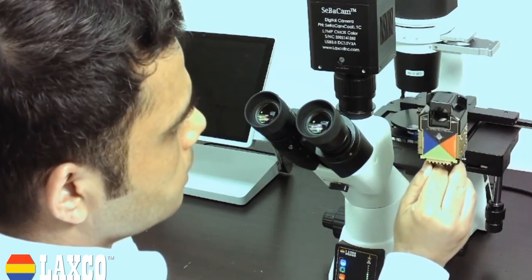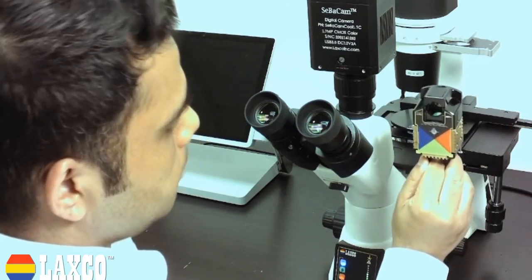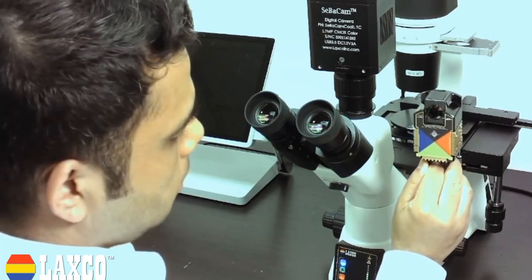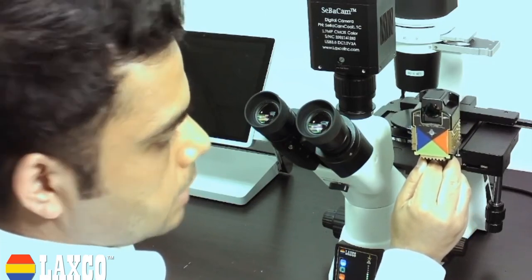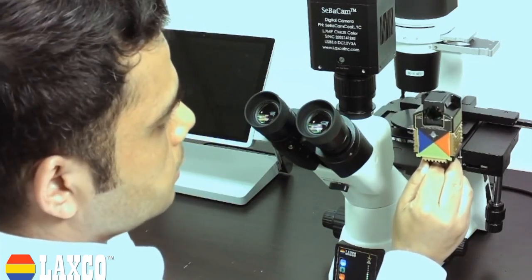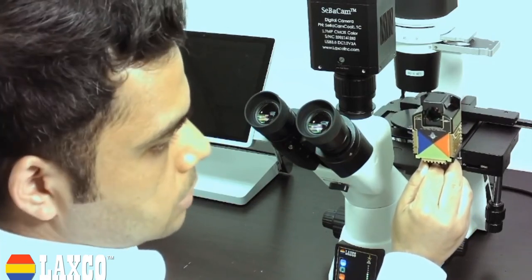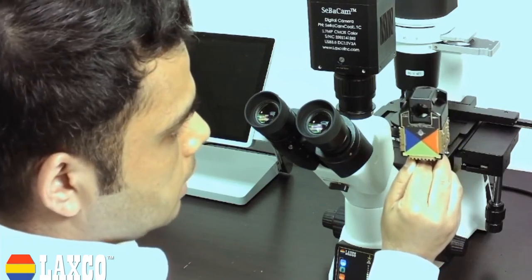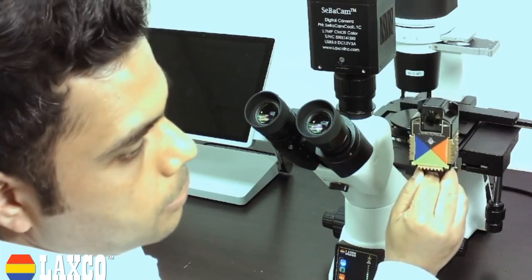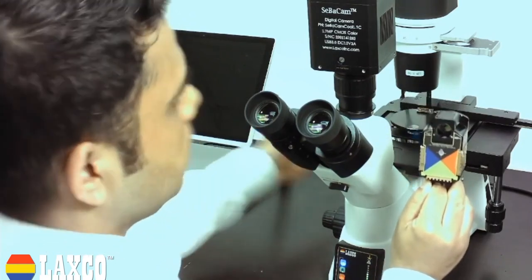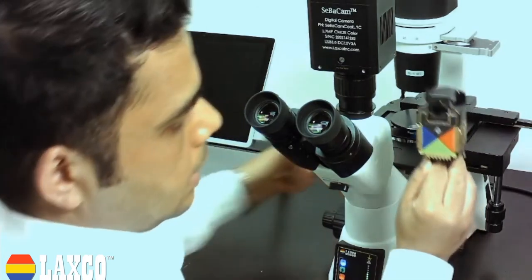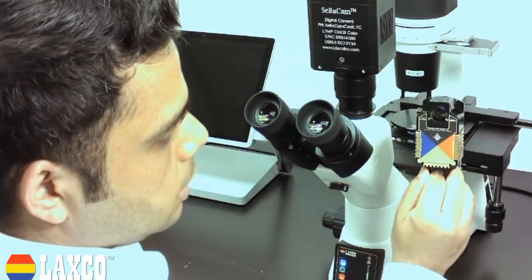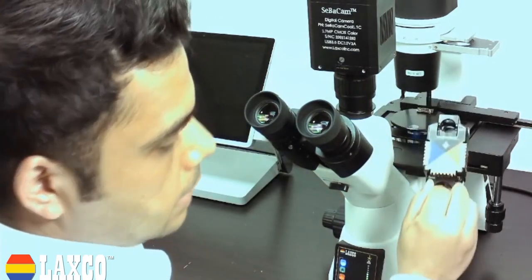To upgrade a basic base package of our fluorescent inverted system, you can buy the system which doesn't have fluorescence on it, but you can easily upgrade it by just opening the back and pushing this fluorescent cube inside.